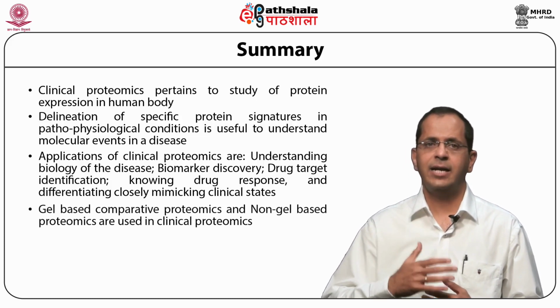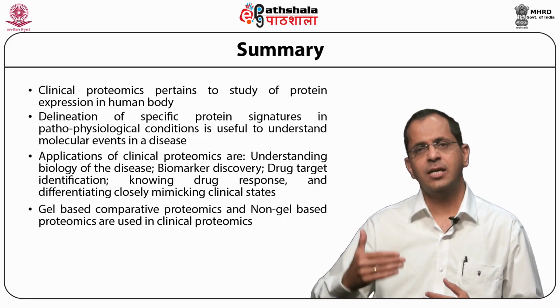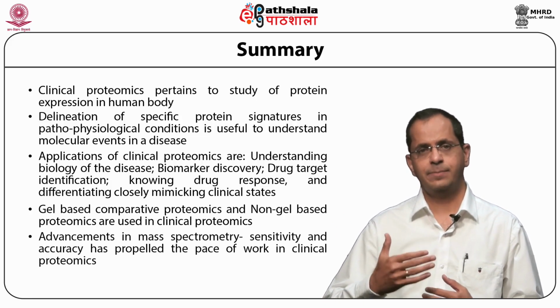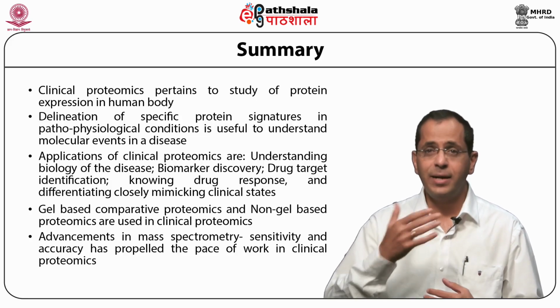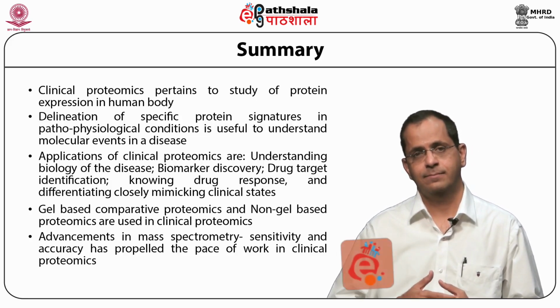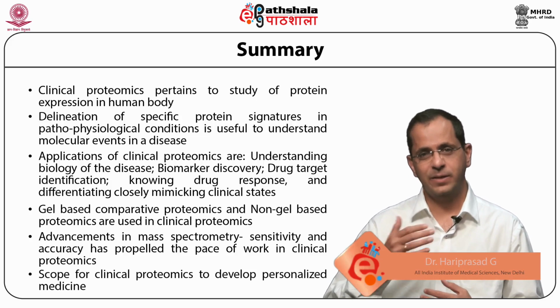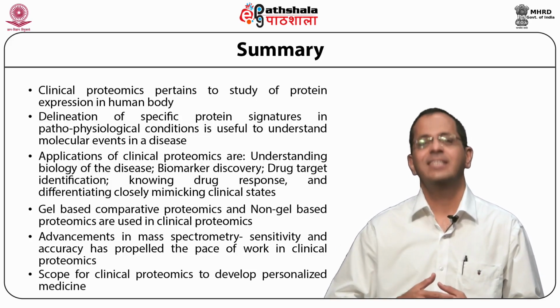Gel-based proteomics and non-gel-based proteomics are used in the methodology of clinical proteomics. Advancements in mass spectrometry with respect to sensitivity and accuracy have propelled the pace of work in clinical proteomics. And as we have understood, there is plenty of scope for clinical proteomics to develop what you call personalized medicine. Thank you so much.